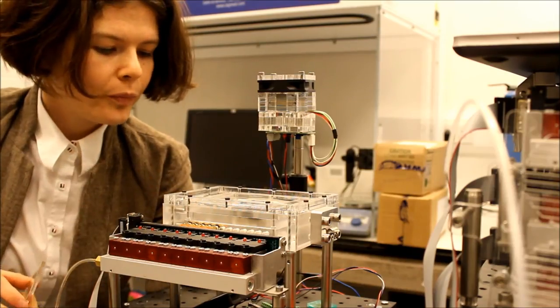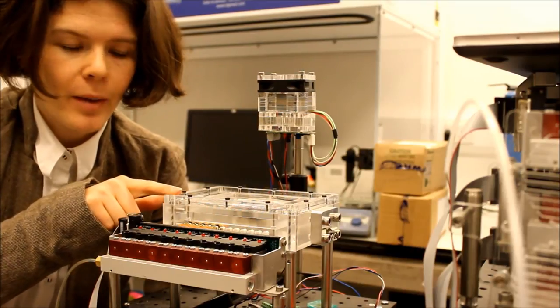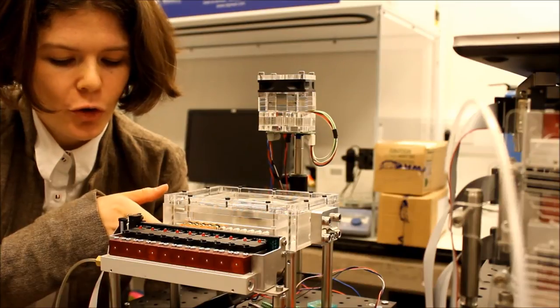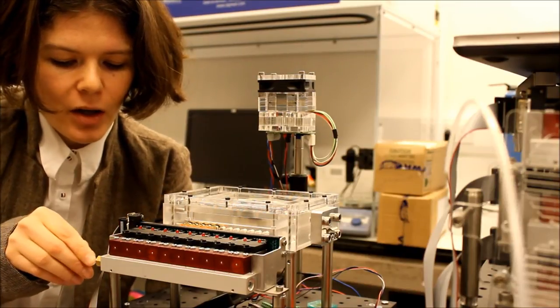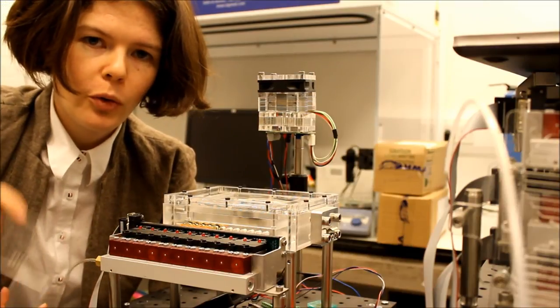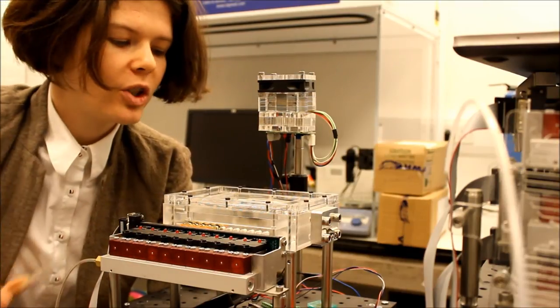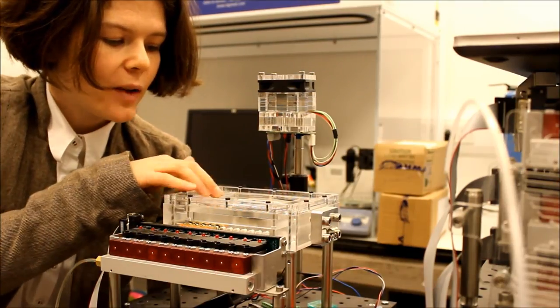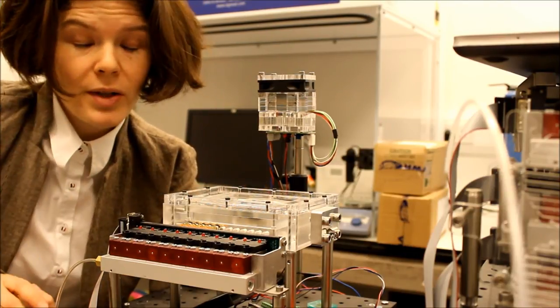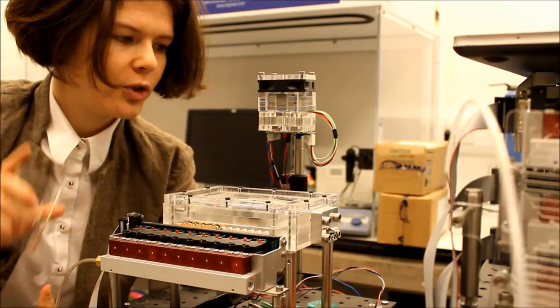And now let's turn to the platform. The platform is made out of a PMMA block with threaded ports that accommodate connectors. The chip is fed with compressed air controlled by electrovalves to open and shut the valves within the chip. We can add as many microcomponents as we want as long as they fit onto the platform without increasing the cost of the disposable chip.